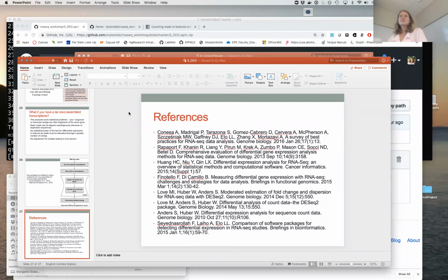What percent of reads mapping is there below which you would just call the data set lost? Yeah, we had that question with the blueberry data set recently. Well, I wouldn't say there's a hard and fast cutoff. So there's a couple of questions here.